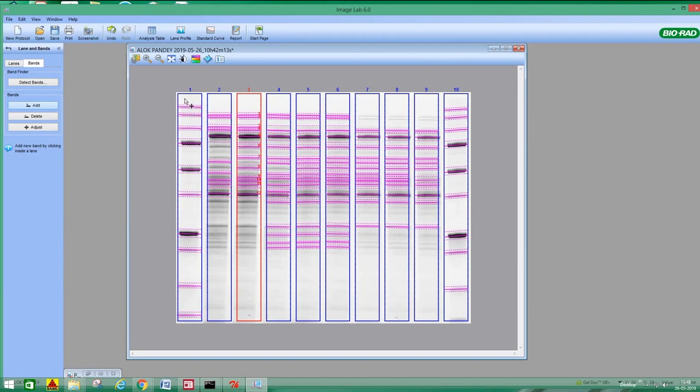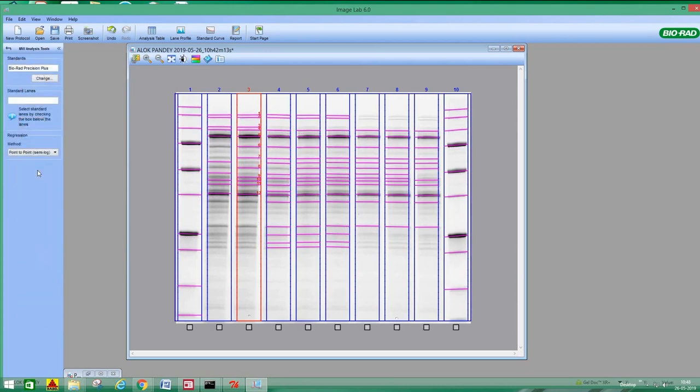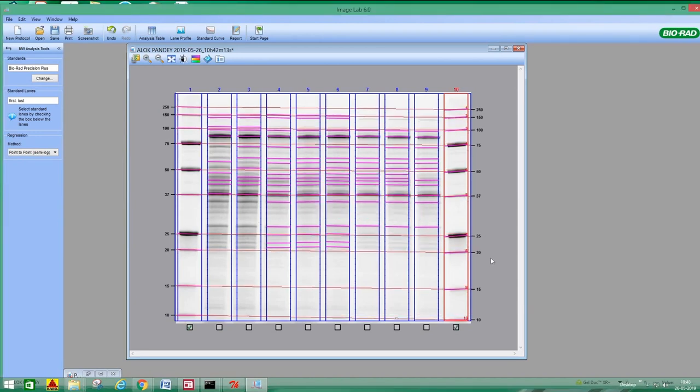So after being done this, we have first detected the lanes, and in second we have detected the bands. Now it's time for calculation of molecular weight analysis. So here the tricky part is you have to select the lane which you have loaded the molecular weight marker. So I am selecting the first lane and the last lane. Okay, so it automatically came.